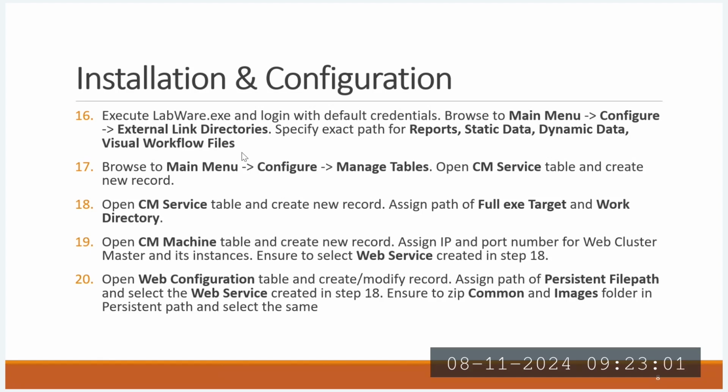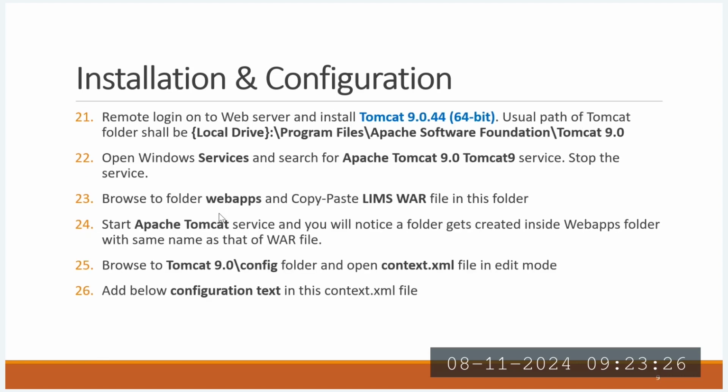Apart from this, if you want to manage the tables and CM services, meaning schedulers, this will be purely controlled through the LIMS application, and web configuration will be the same. A few customers manage both a web-based application and a desktop-based application. A few customers follow only web-based, and a few follow only desktop applications. This will also be the same as I communicated earlier.